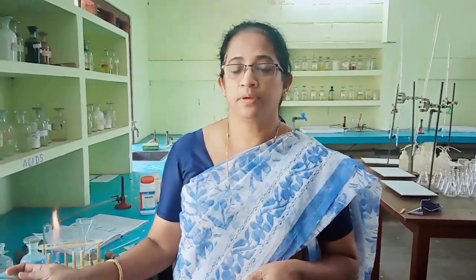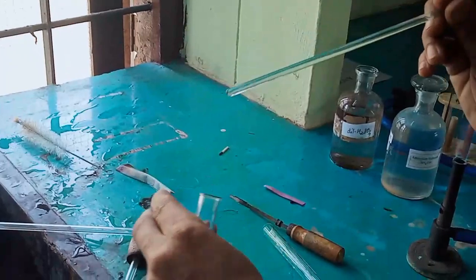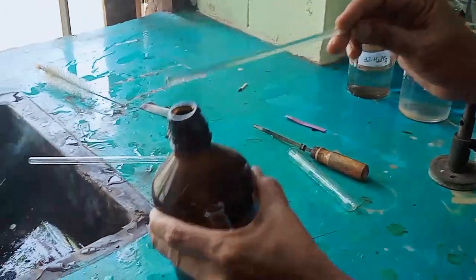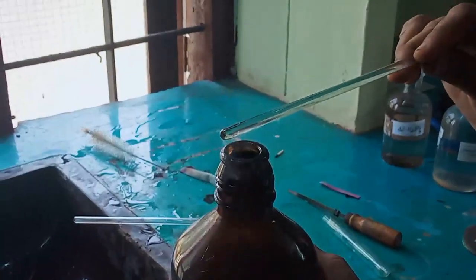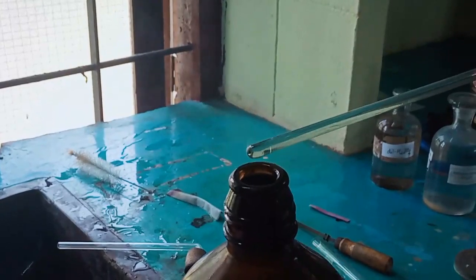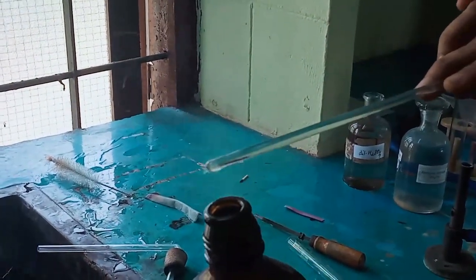Now we are going to observe the reaction of a basic gas, ammonia. Ammonia is a colorless gas with a pungent smell, and the gas is tested using hydrochloric acid. A glass rod dipped in hydrochloric acid is brought near ammonia gas. So ammonia vapor produces dense white fumes. So the observation is a glass rod dipped in hydrochloric acid brought near ammonia vapor produces dense white fumes.